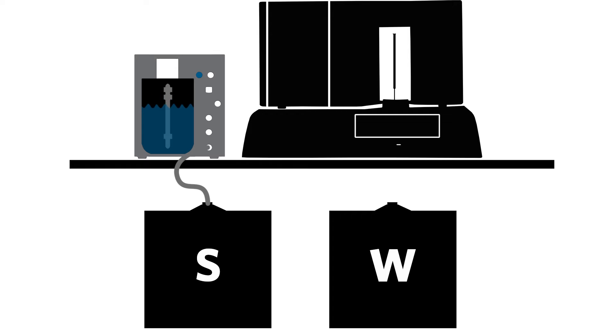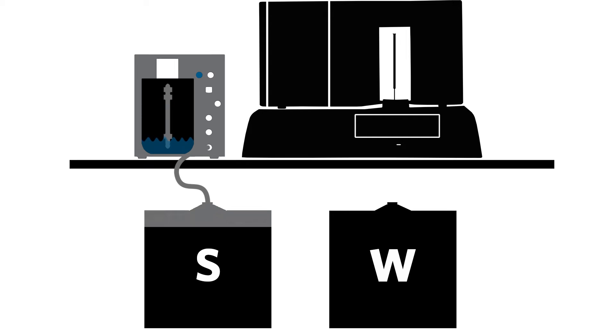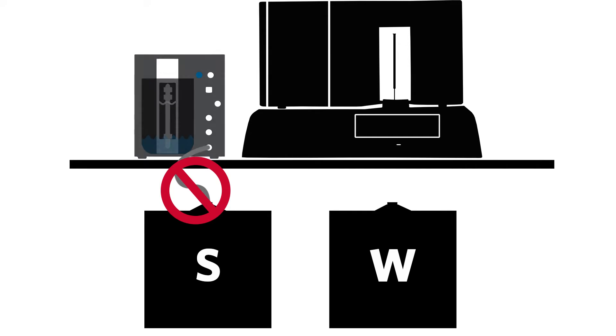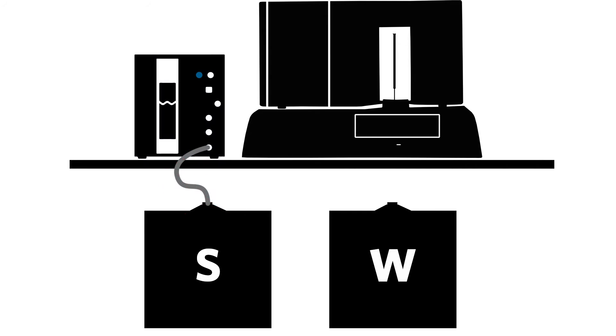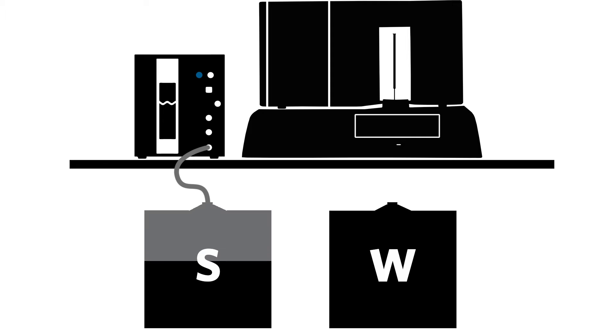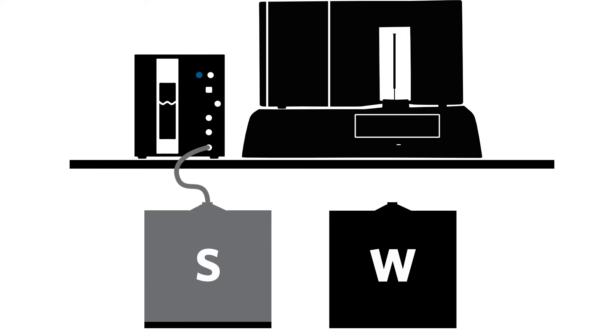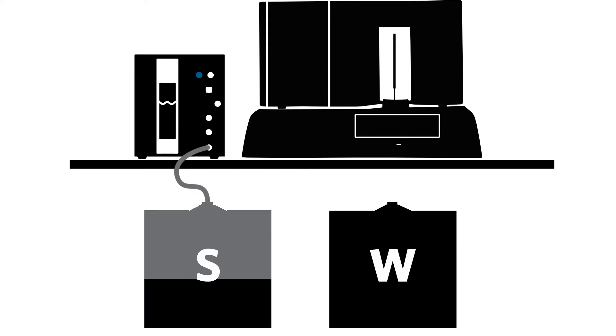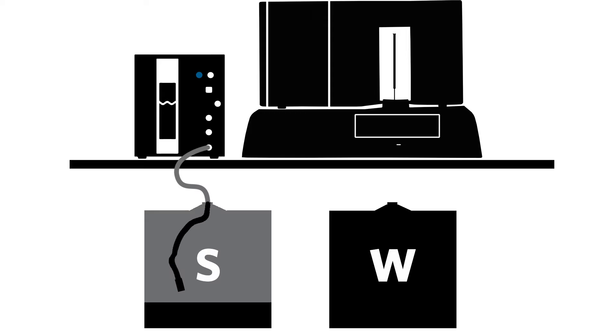When you hear a slow beep, it means the SDS cannot acquire sheath fluid. This usually happens when the sheath fluid container is empty or the level in the container has dropped below the solvent filter on the end of the sheath line.